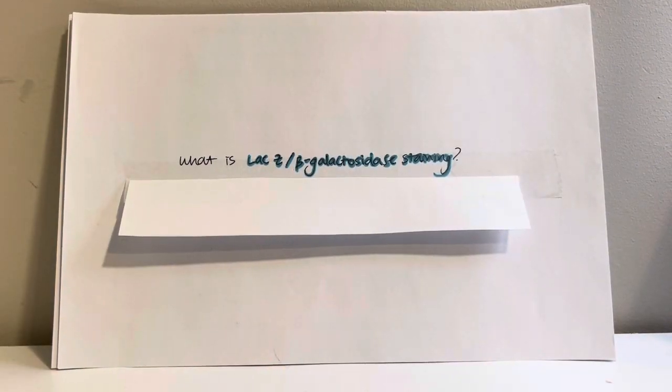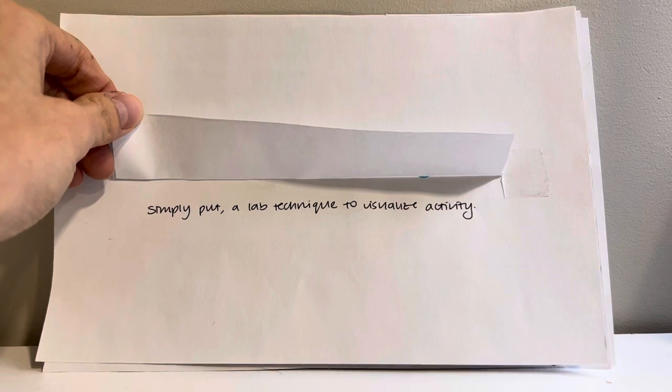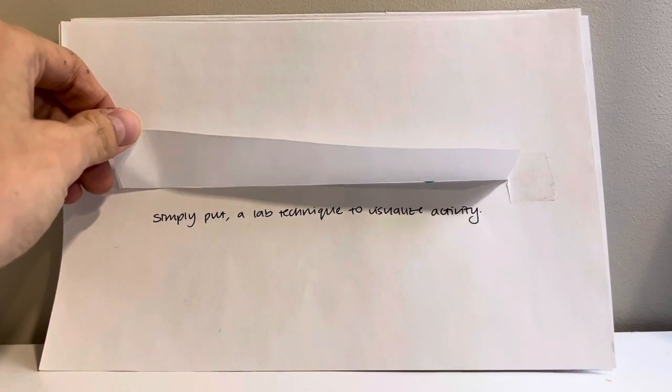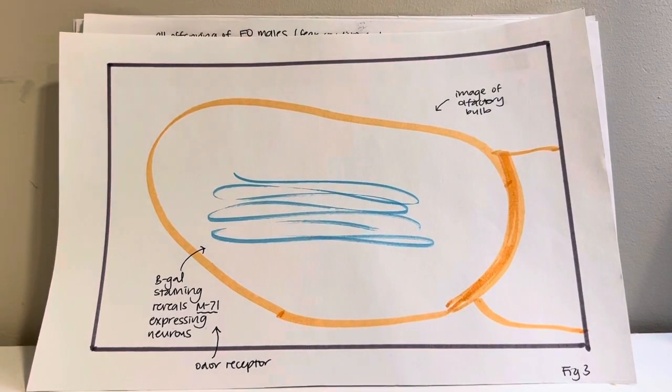So what exactly is LacZ beta-galactosidase staining? Simply put, it's a lab technique to visualize activity, much like how I'm showing you this definition. A great way to see the efficacy of this technique is by looking at an example.